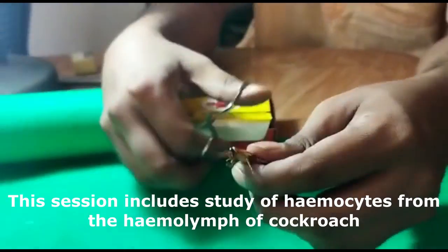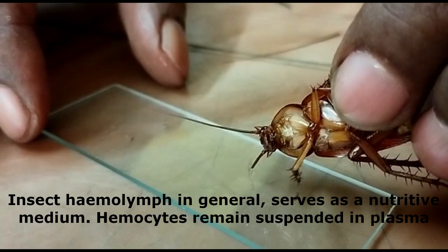Welcome to Jubangla's practical session. In this session, we will study the hemocytes from hemolymph of cockroach.